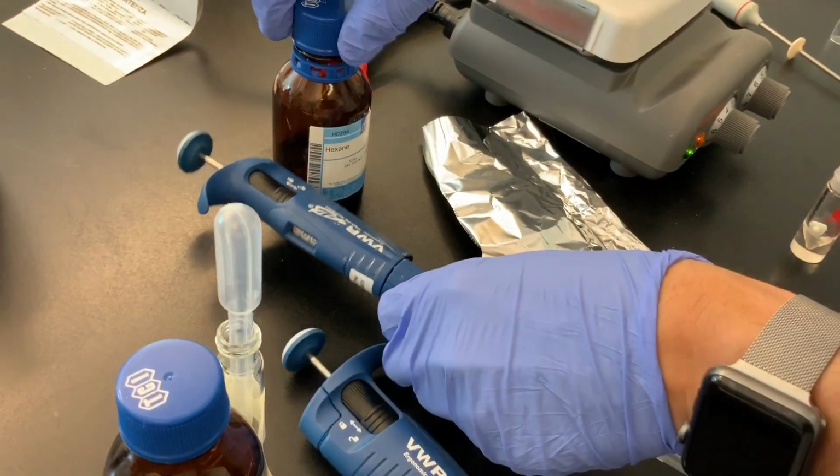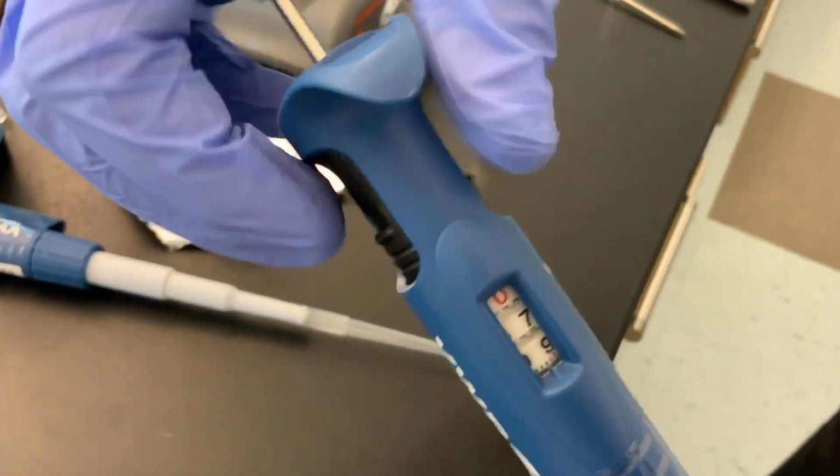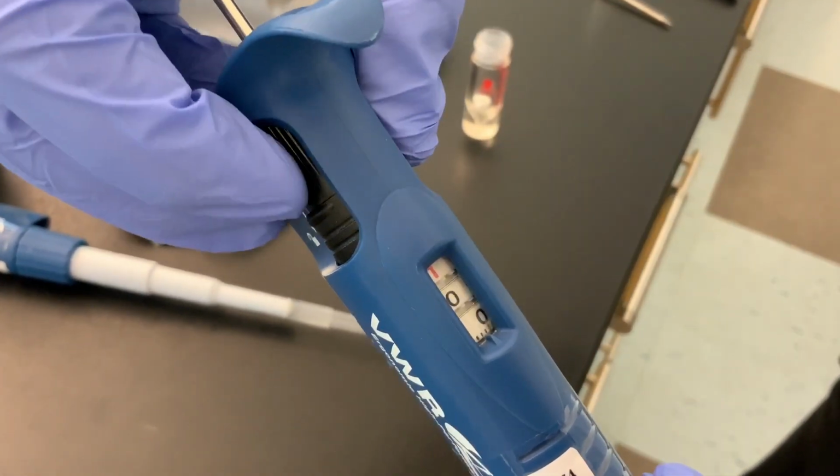All right, so this one on the right we'll reserve for hexane, and then we'll do the same thing with another pipette for toluene.